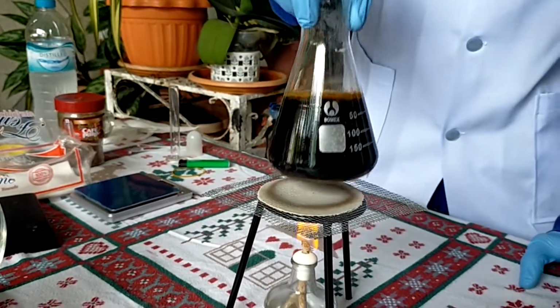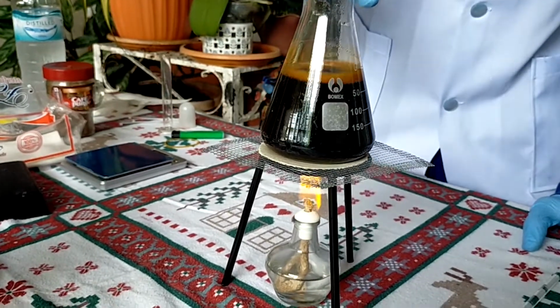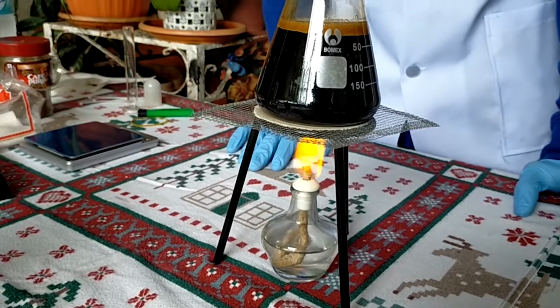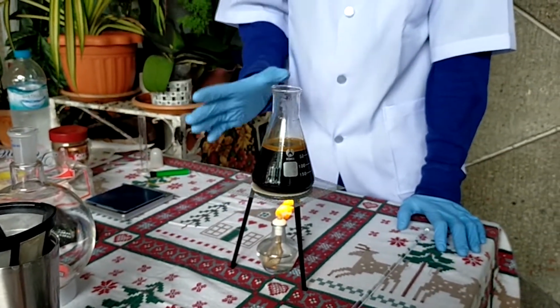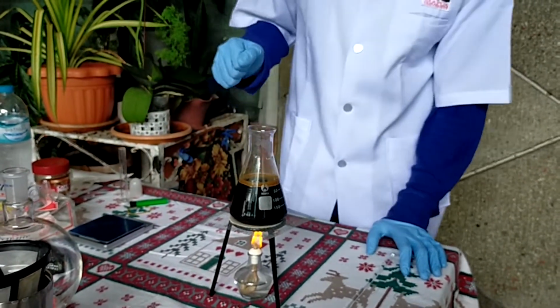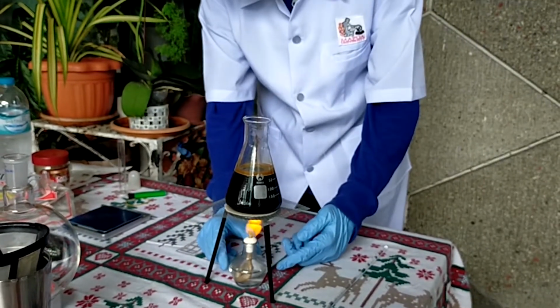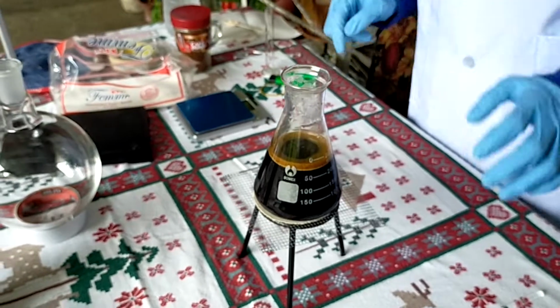Okay, so our 15 grams of coffee and our 200 milliliters of water has been heating for around 15 to 20 minutes. Of course, we just want to heat them before the water boils. Of course, this also includes the sodium bicarbonate, which I added pinch by pinch. So it's been around 19 minutes. I think this is enough. And we will just let this cool.